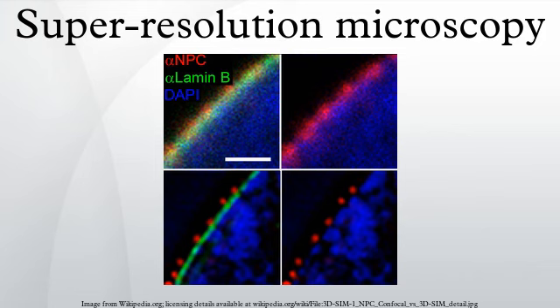This is much like STED, where the off state is the ground state of fluorophores, which is why the equation also applies in this case. The value is smaller than in STED, making super-resolution imaging possible at a much smaller laser intensity. Compared to STED though, the fluorophores used in GSD are generally less photostable and the saturation of the triplet state may be harder to realize.